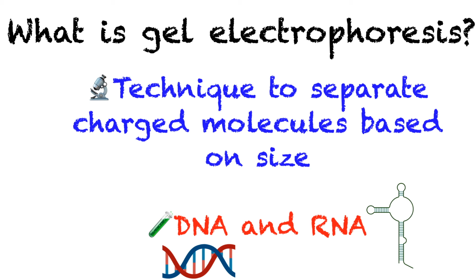First is gel. Gel is a thick, clear, and slightly sticky substance, and we use gel to load our samples and to electrophorese them in a certain buffer, a certain medium, and it also consists of electrophoresis. What is electrophoresis? Electrophoresis, in general terms, describes the migration and or separation of charged particles or molecules or ions under the influence of an electric field.